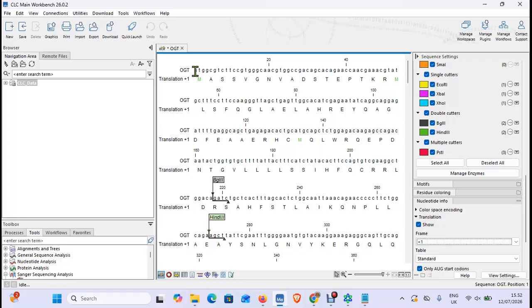So I always tend to go in multiples of 3, or, well, let me walk and talk. So, for example, ATG equals 8, because that's 2, 2, 4. So that's already 8, but that's not a heck of a great. So now we're up to 12, because we added 4 more. Then, okay, CNG, we're at 20, great. TCTT, that's 30. Then 42, then 50, then 60. Getting close, 66. Well, that'll do just fine, thank you so much.